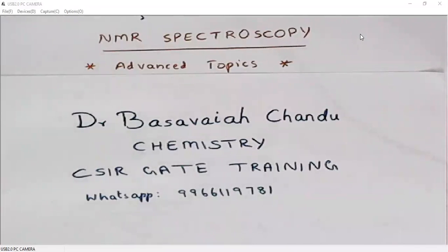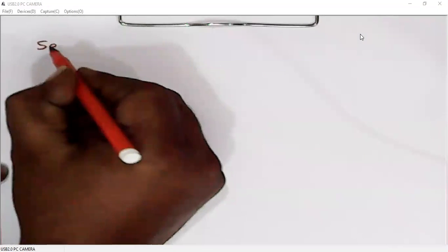Good morning, students. Welcome to the class on NMR spectroscopy. We are discussing advanced topics in NMR spectroscopy. Today we will discuss second order spectrum.